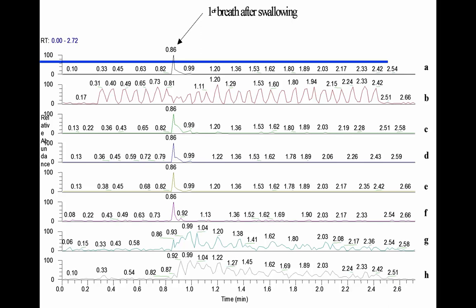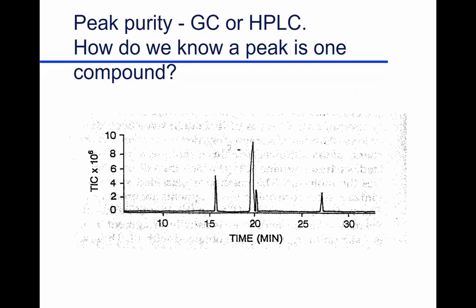So this first chemical, we can see it comes up very sharply. That breath, there's a little bit of exhale, exhale. It only lasts like 3 breaths and it's gone. And that's the same for another ester, very volatile components. But some of these don't hit you immediately, they're lower on impact, but then they keep on dragging on, aftertaste. So this is your initial impact, and this is your aftertaste of the product. And we wouldn't have this kind of an understanding of how foods act and how they interact with flavoring without mass spectrometry. There's no other way to do this kind of thing. It's really a fascinating contribution, comes right down to it.